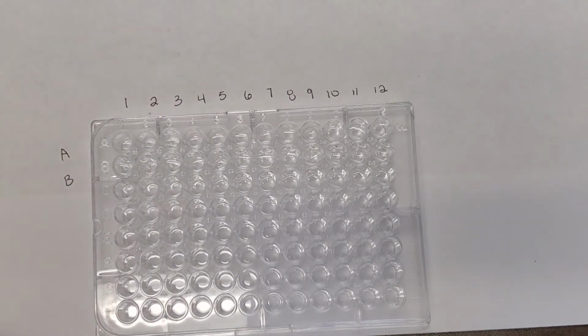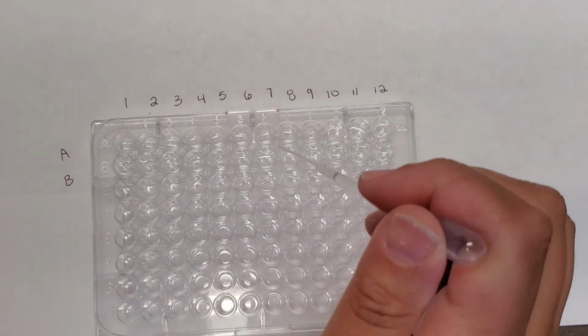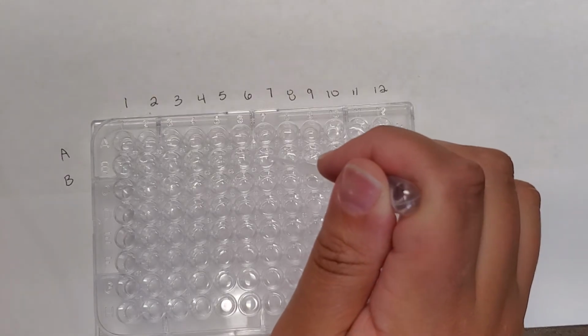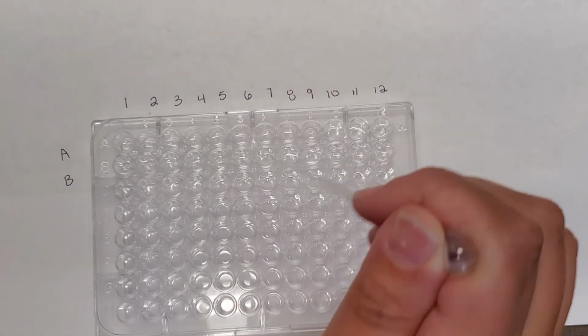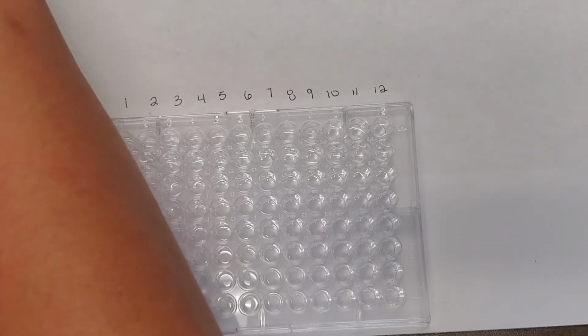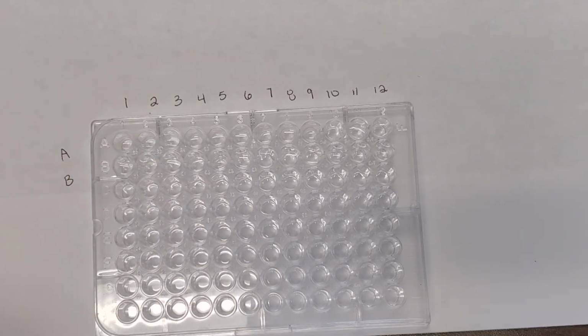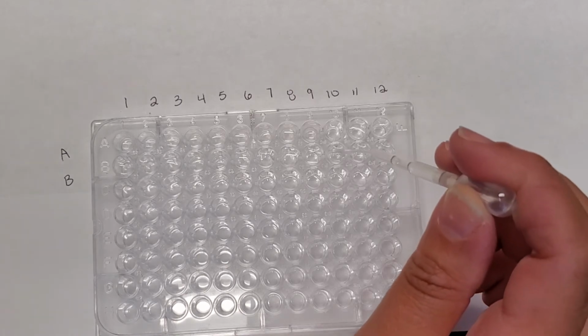Move on to patient E. And patient E is going to go into wells B7 through 9. And our last patient is patient F. So patient F, again, is going to go into wells B10 through 12.